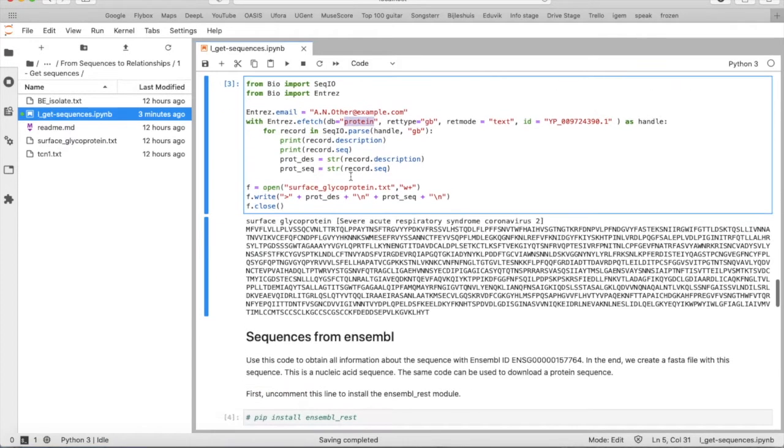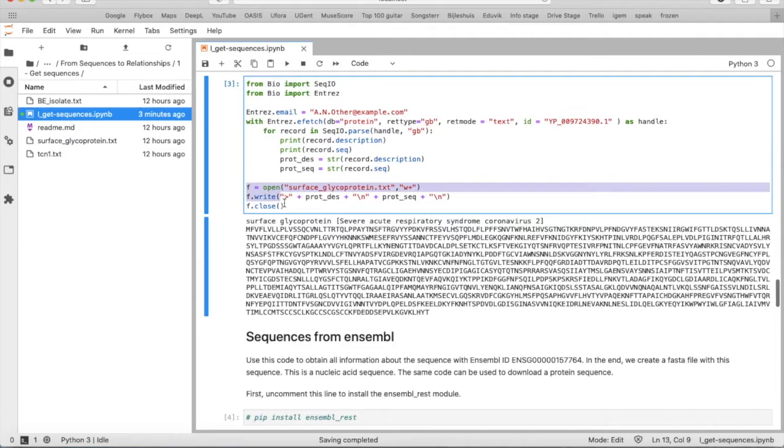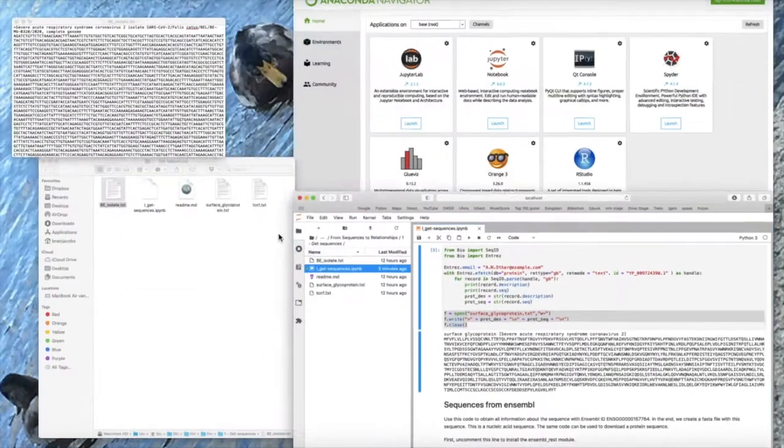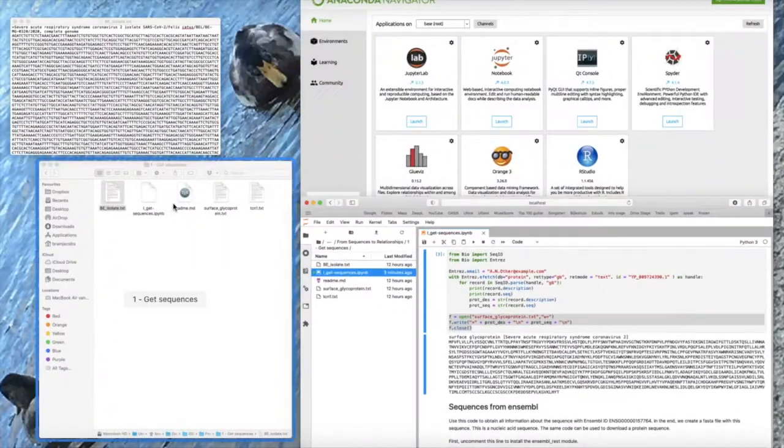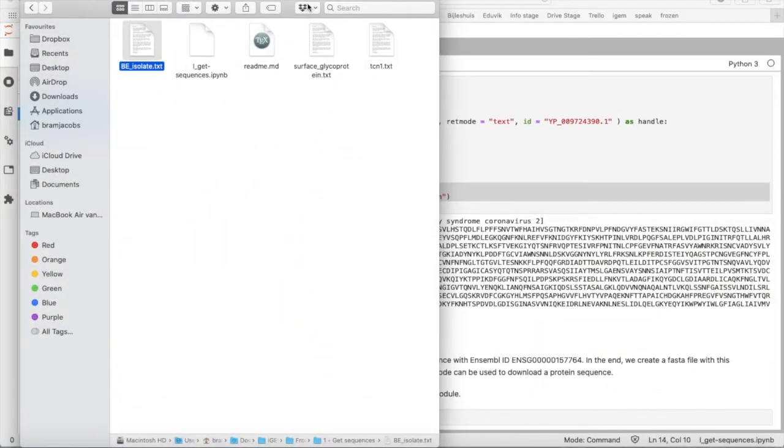And then to save the FASTA file you can just use the same code as before. And then also this file surface glycoprotein will appear in your folder.